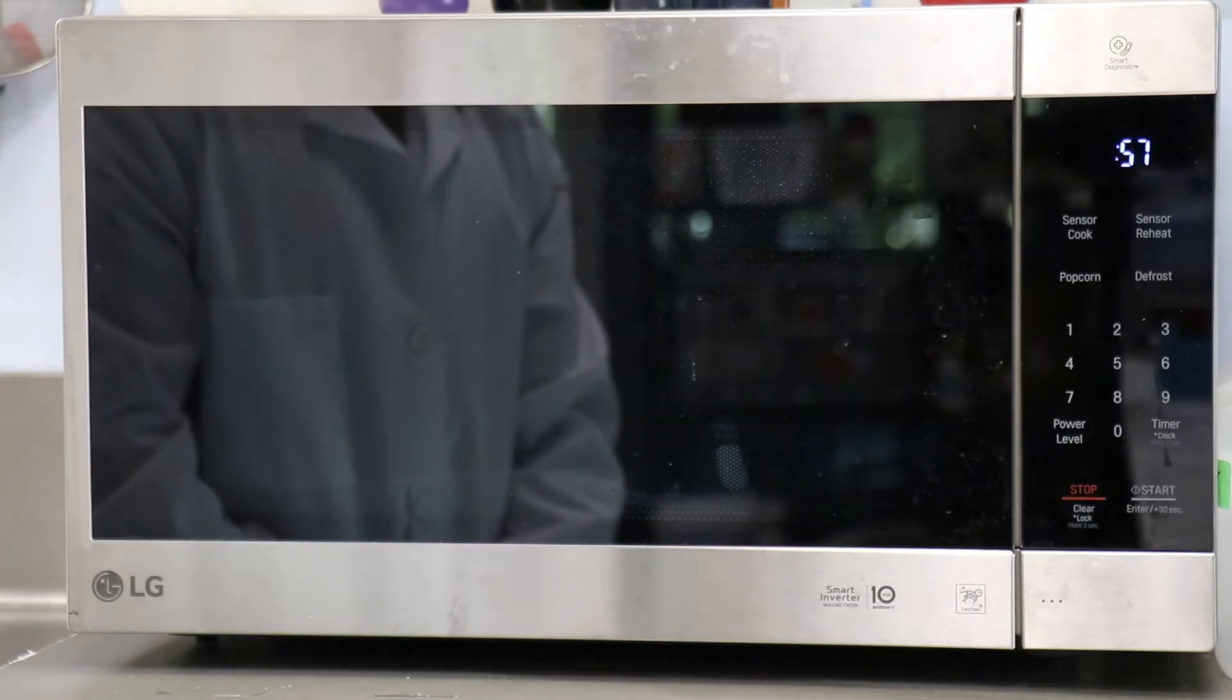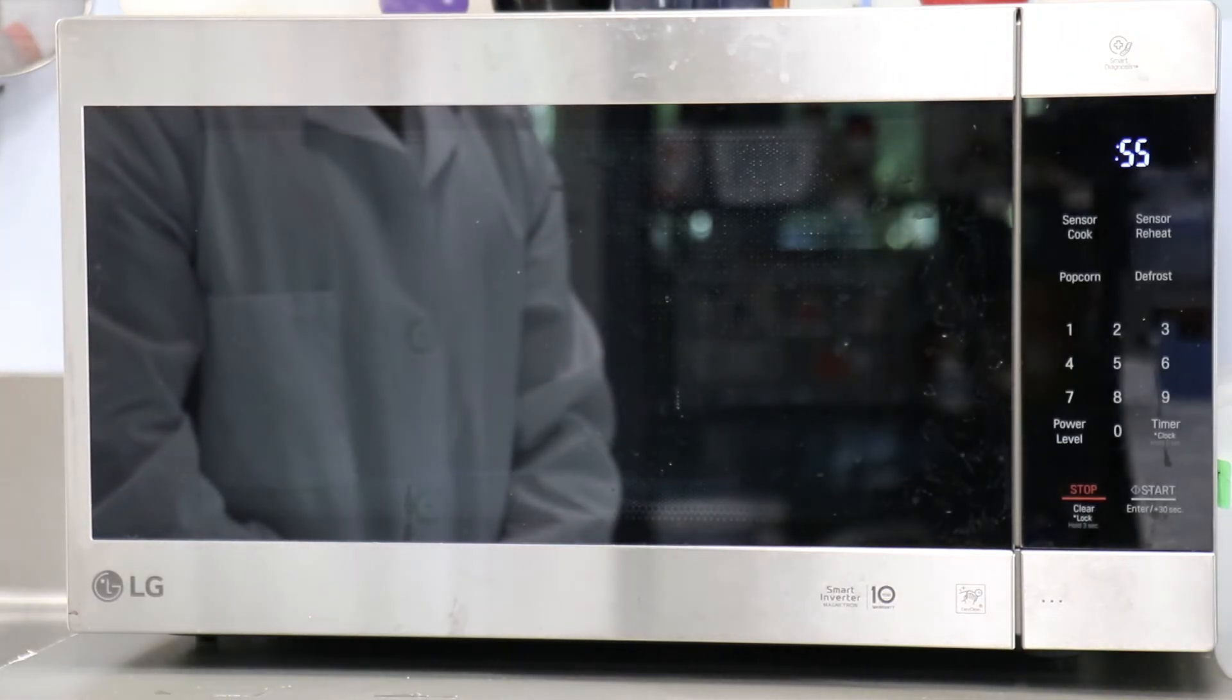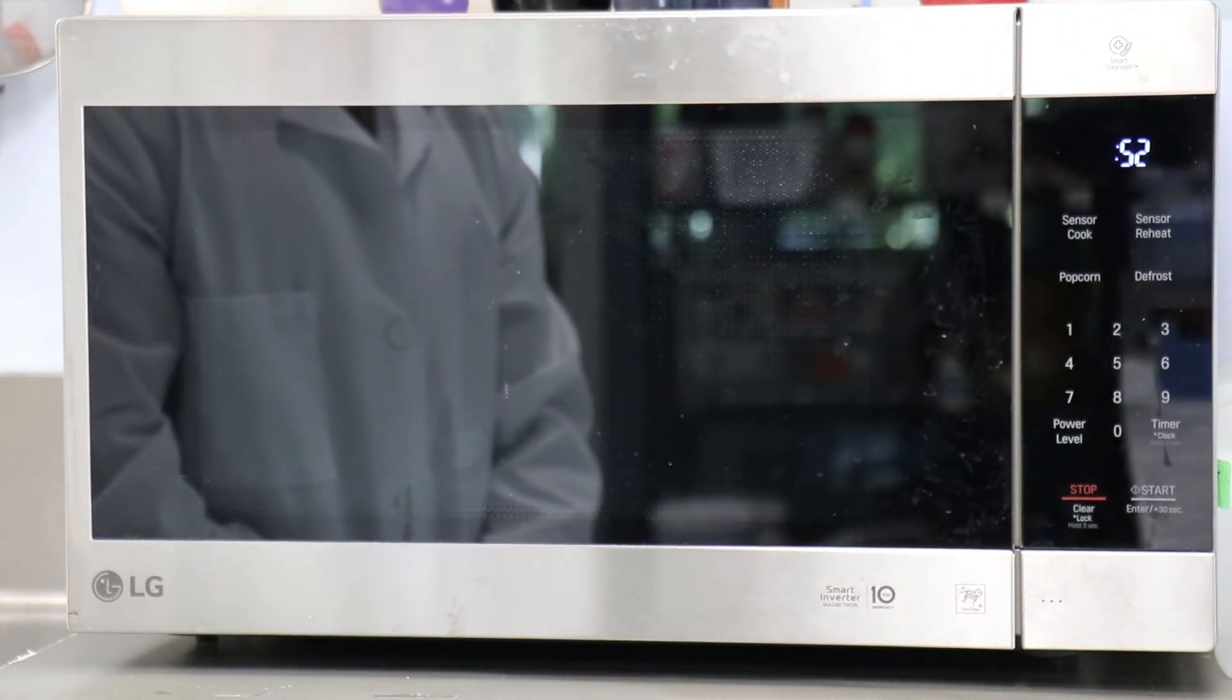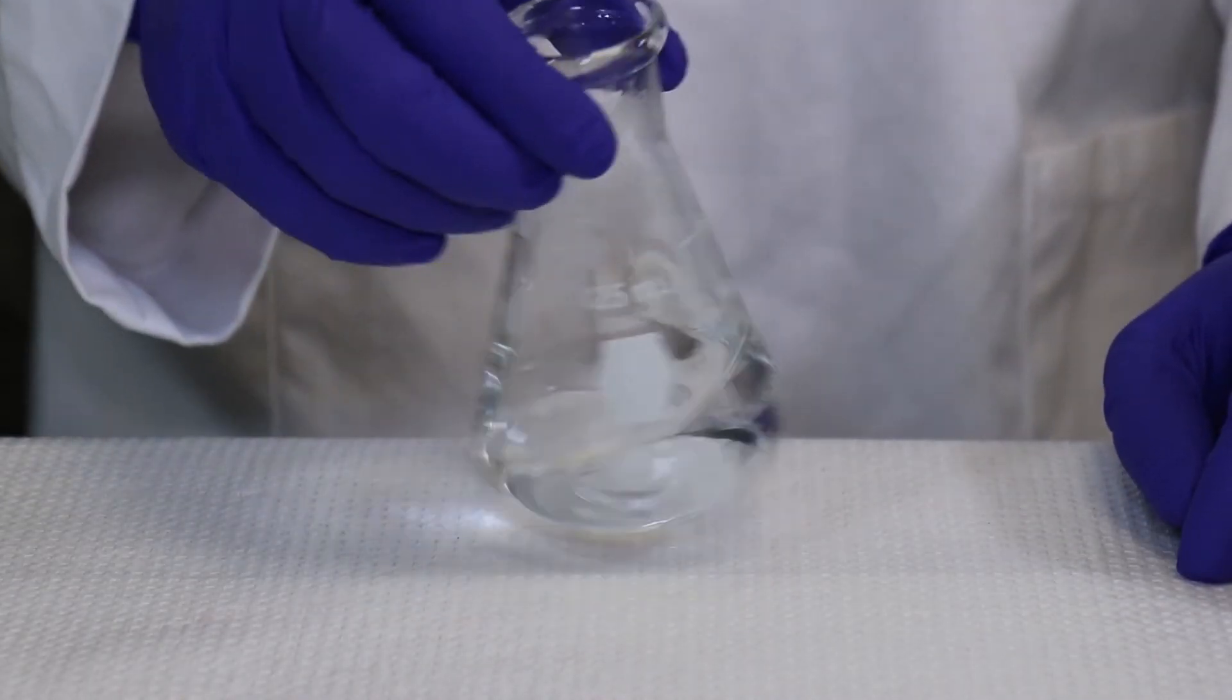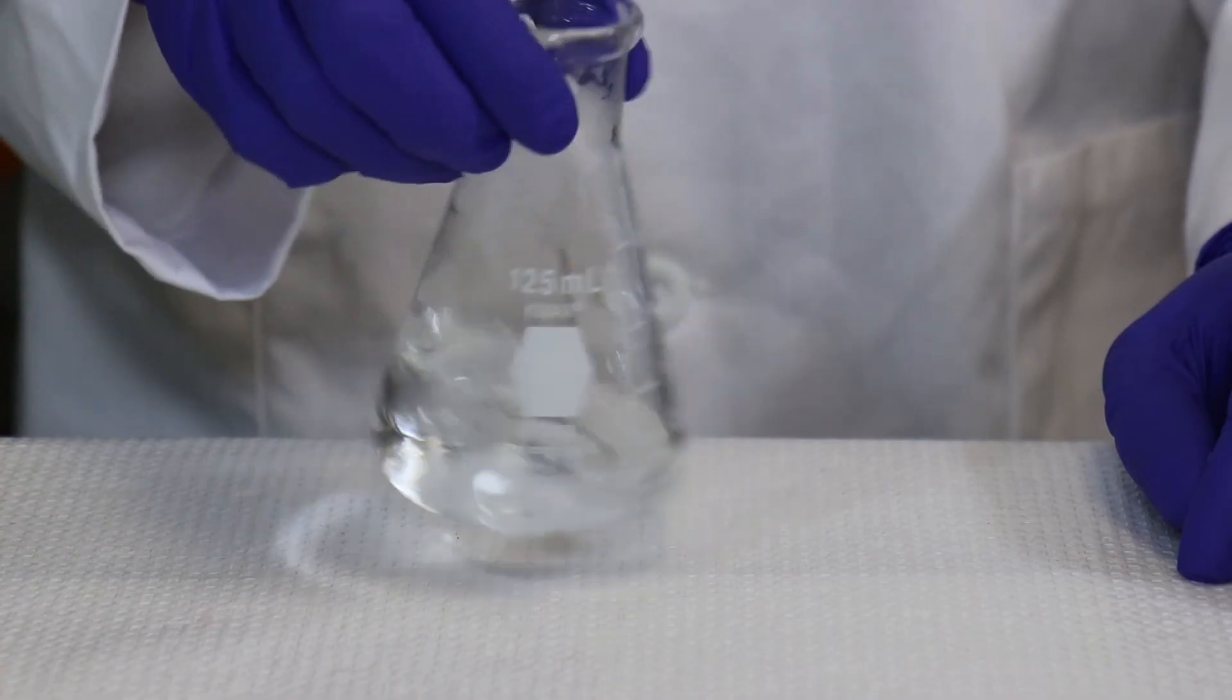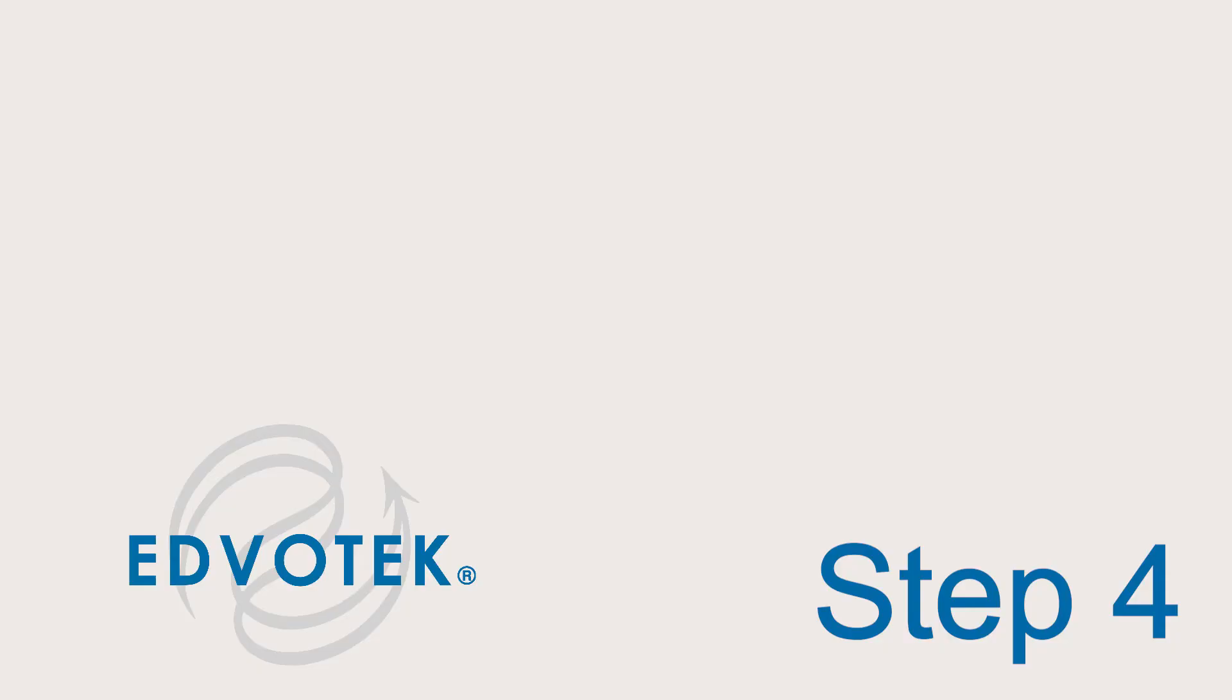Continue to heat the solution in 15 second bursts until the agarose is completely dissolved. The solution should be clear like water. Step 3: Cool the agarose to 60 degrees Celsius by carefully swirling the flask to promote even dissipation of heat.